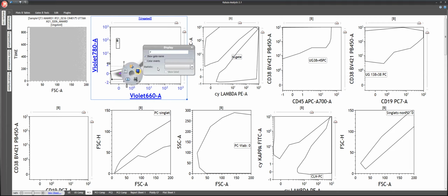And if you see, the number of events which we have acquired after excluding the junk is almost 5.4 million or 5.5 million in this tube, and the other tube is equivalent. So we have acquired almost 10 million cells in this sample.